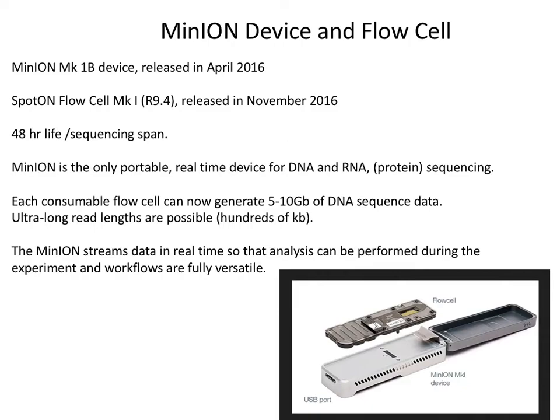But really, we're talking about optimized libraries. There's still an issue with the libraries, because you need tethered proteins that pull your library through the pores. If you don't get it right, you don't get the sequencing done. These are proprietary DNA they've done work with, and people have actually got large amounts of data. But in real life, the data size we're getting is not approaching that.